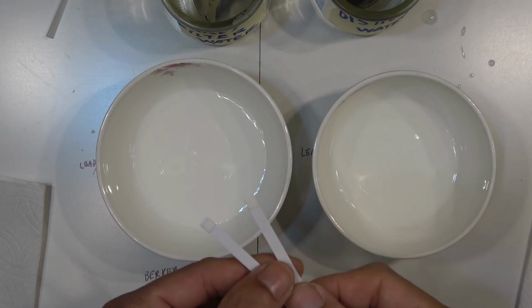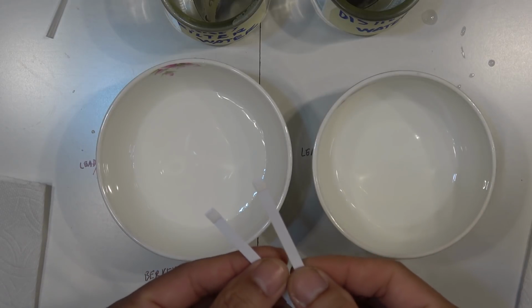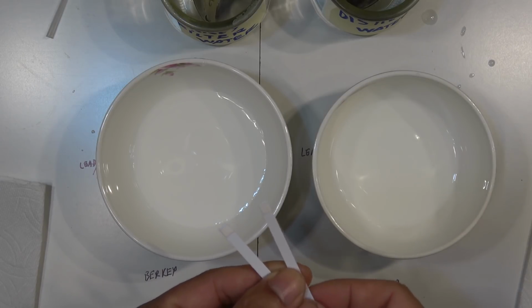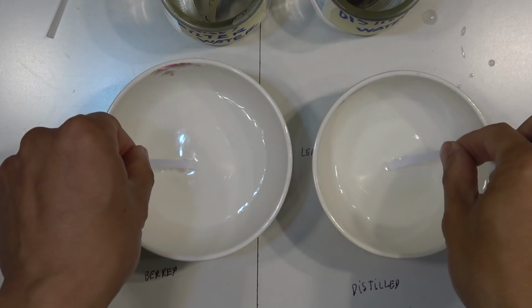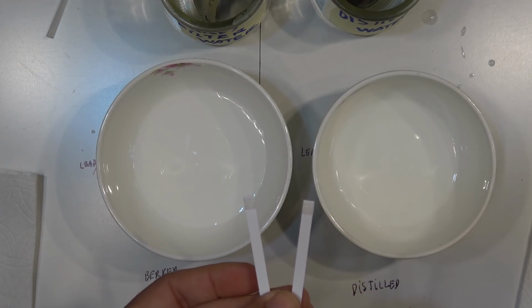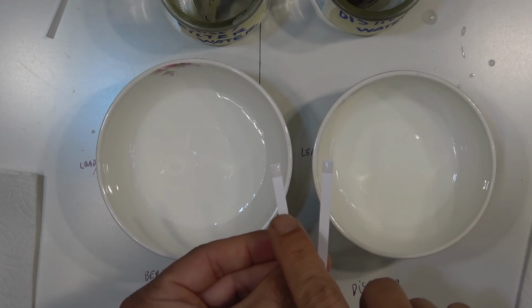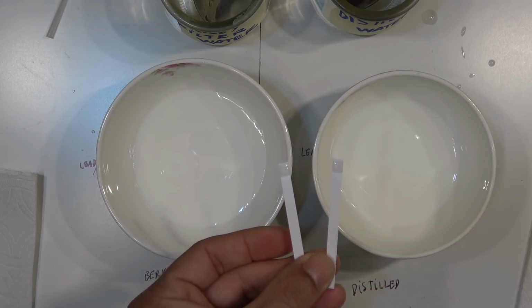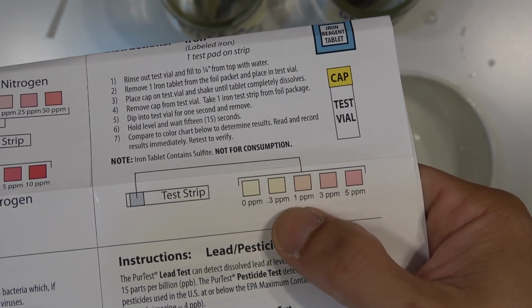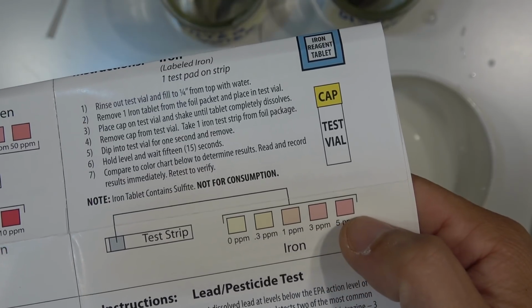But for this iron test, you're going to just dip it in for 1 second and you have to remove the strip. And then you wait for about 10 to 15 seconds before you read the results. So here we go. 1 second. Okay. And I'm going to hold it for 15 seconds. So this one is distilled water. This one is Berkey filter water. And for this, you want the result to be white, as white as possible. More red means more iron.